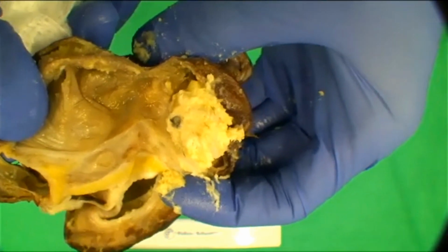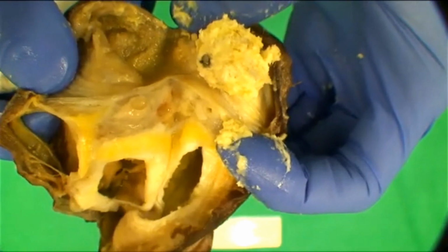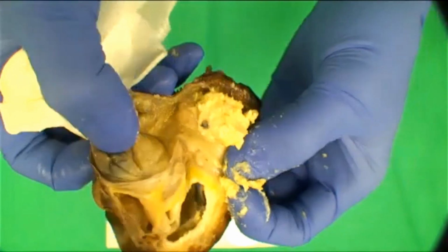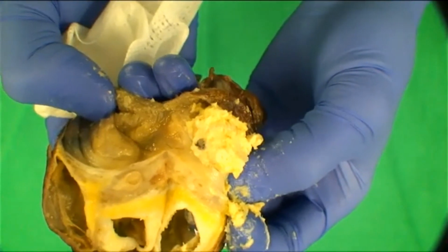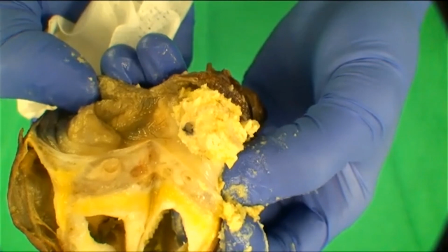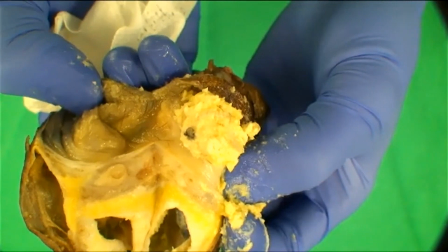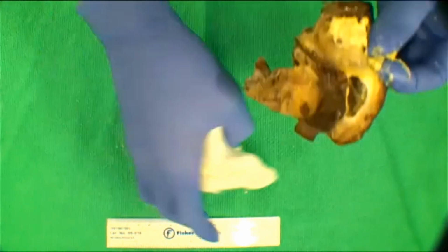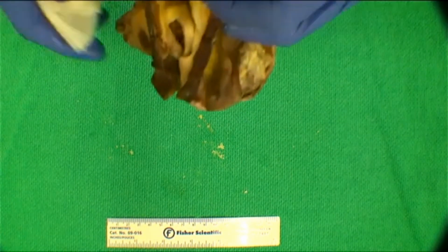So why are these nodules important? Does anybody know the significance? It's usually a collection of mature components rather than immature. So that's a reassuring feature. Usually you won't have immature components quite obvious like this. And if you have an immature component, they tend to be way more solid rather than protruding into the lumen. We'll do our poll.